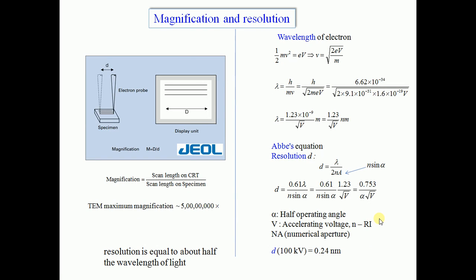What is magnification? Because all our MSc students and other research students are here, let me spare some time in discussing the difference between magnification and resolution. When we say magnification, 5 crore or 1 lakh, what exactly do we mean by this?